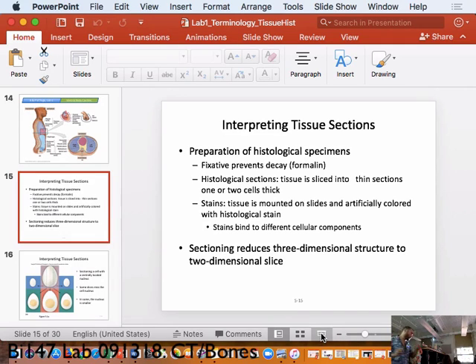Okay, now you will notice the deck by you is a little blue container. You see that little blue container on top of it? It says Connective Tissue Slides or CT Slides or something like that. See it? Yeah. We are going to look at some slides today, amongst other things.